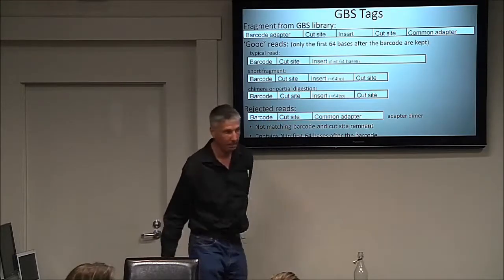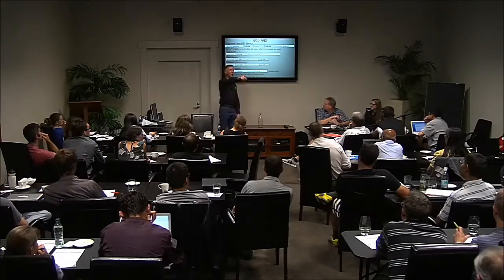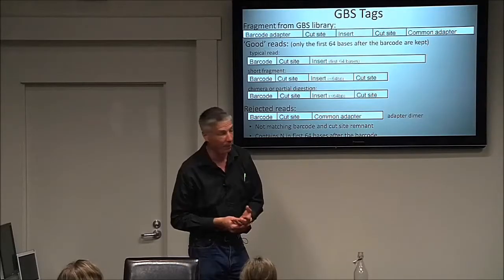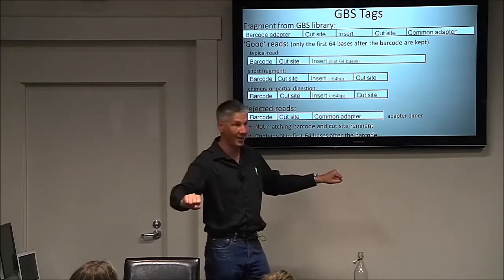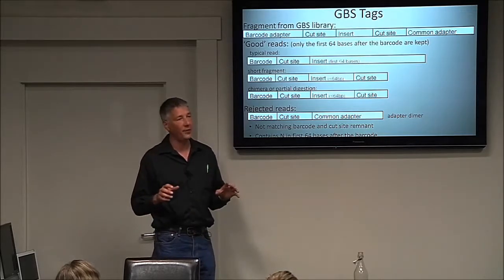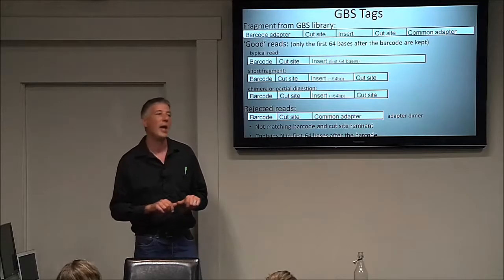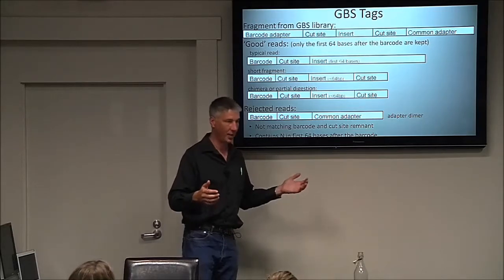How often does that happen when you get one? It's hard. You're going to charge me money, aren't you? Because I'm going to say it depends, and you don't know. It's a great question. I think somebody could probably determine it empirically if they had long enough sequence reads to read through these things all the way and sort it out. But you can imagine that it would happen more often if you had too few adapters, because there would be more opportunity for your genomic DNA to ligate to itself. And it would be less likely to happen if you had enough or excess adapters.